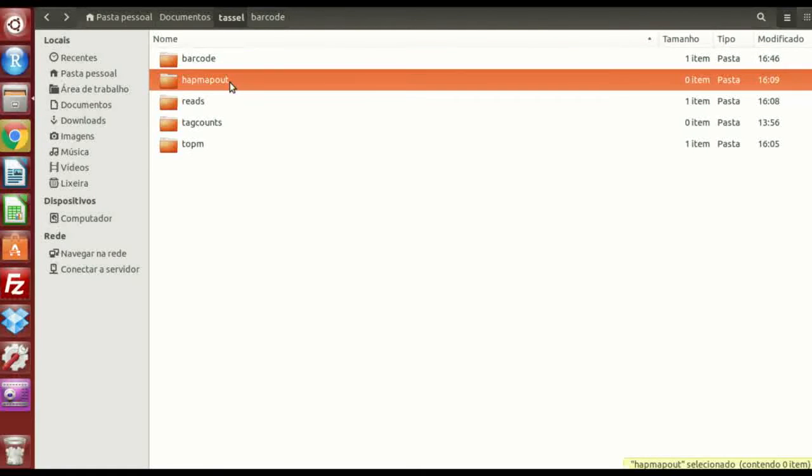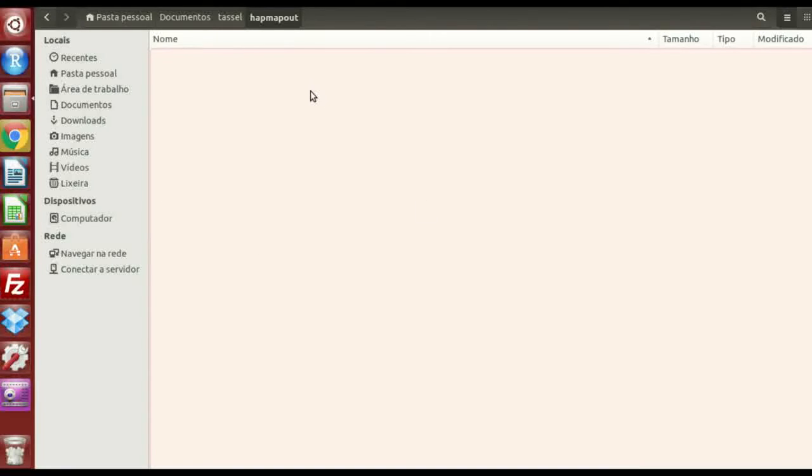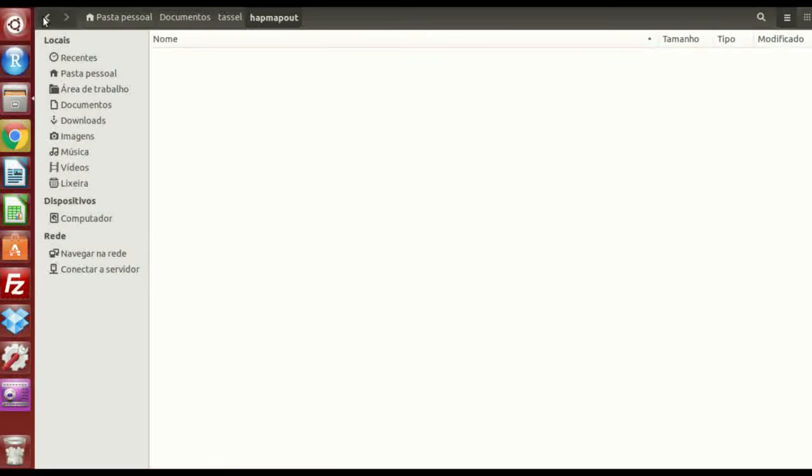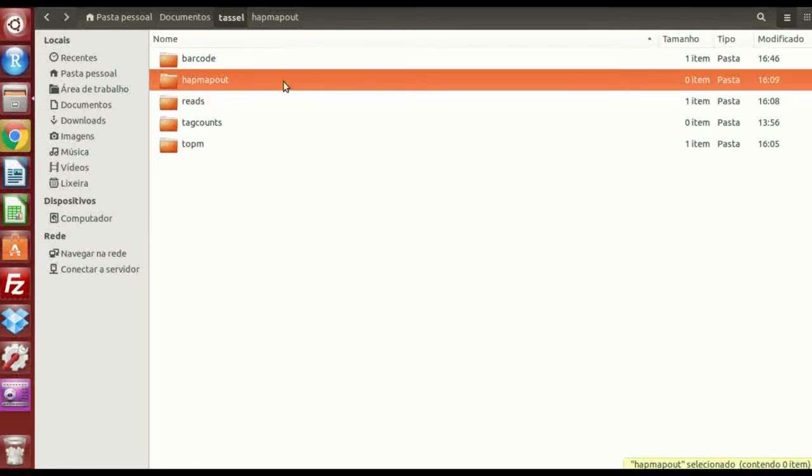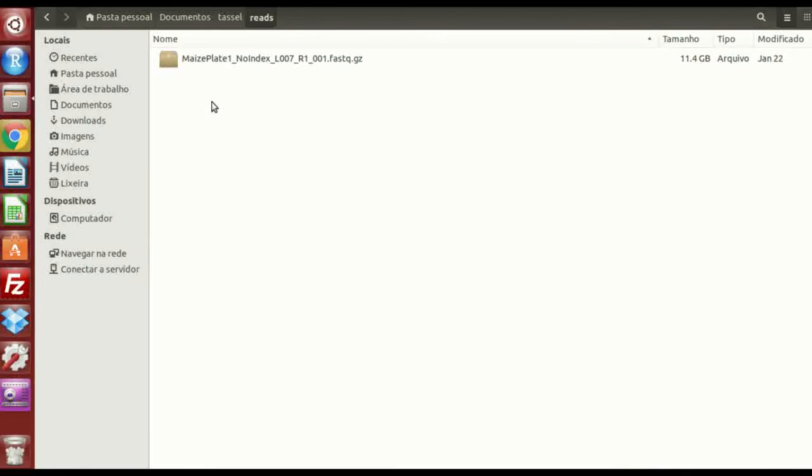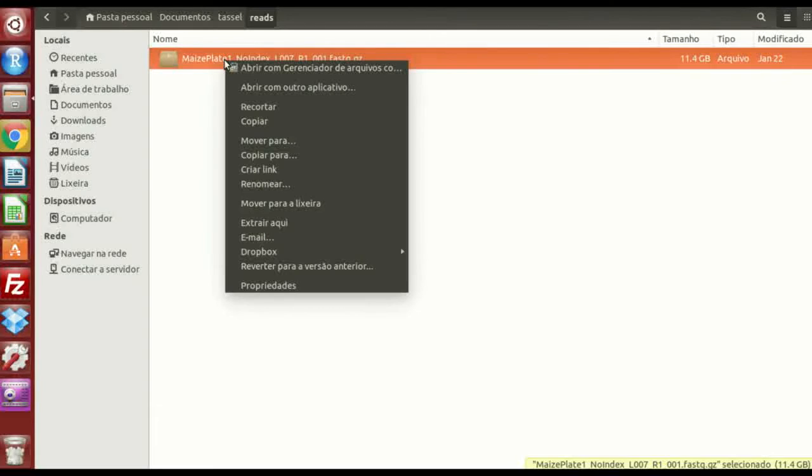HapMapOut, this is the file where your results gonna be, your output file. So there's nothing yet, because we didn't run the analysis. Reads, where I'm talking. Another important thing here, is that you have to rename your FASTQ file, with your flow cell name, and lane number.